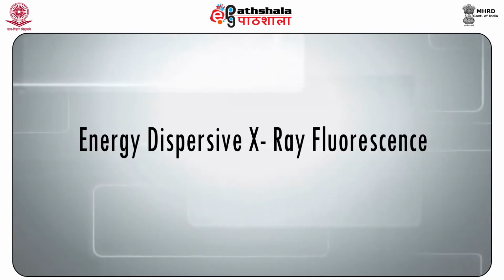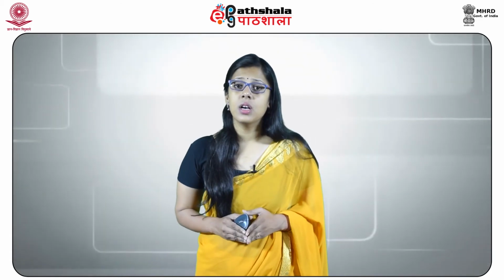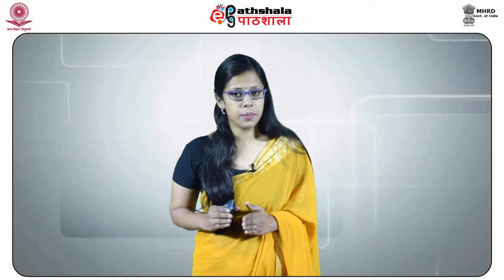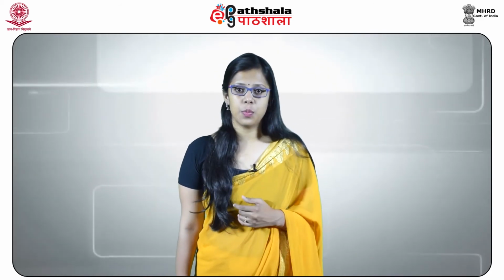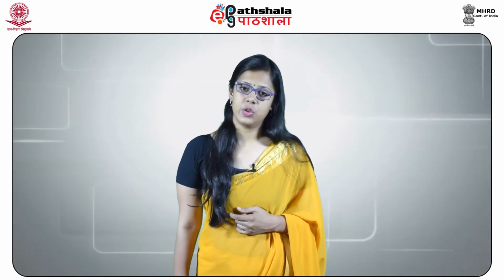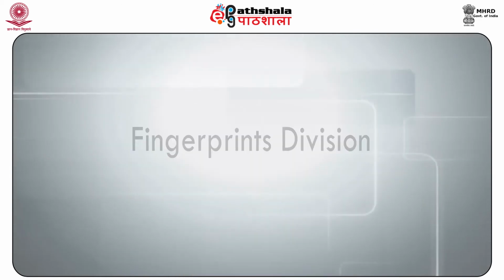Next we have energy dispersive X-ray fluorescence, that is XRF. XRF is a non-destructive analytical technique used to determine the elemental composition of a material. It is an X-ray technique based on the emission of characteristic X-ray radiation when a sample is exposed to exciting radiation from a more energetic X-ray. The spectra displayed show intensity varying with energy or wavelength.